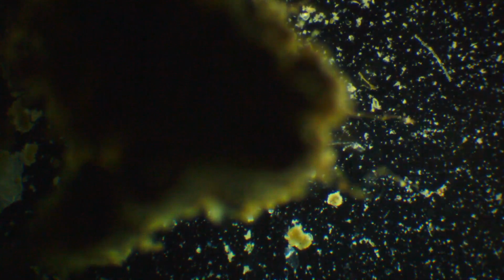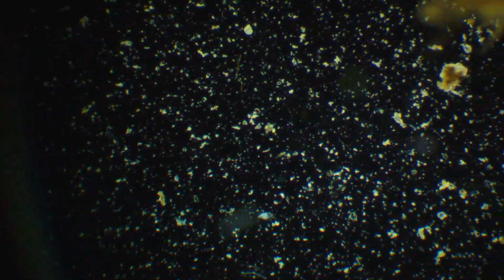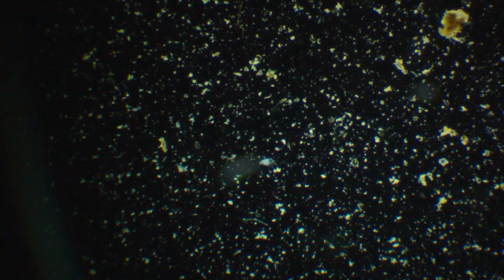And here we have a lumpy friend. And here we have a little rotifer friend. And here we have a little paramecium friend. Still haven't found a tardigrade friend. What's this thing? It's a jiggly thing, but it looks like it might be dead.